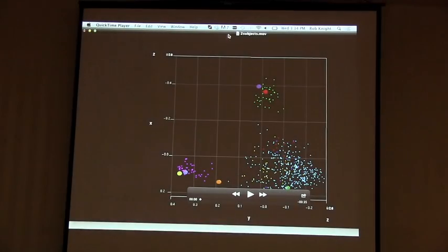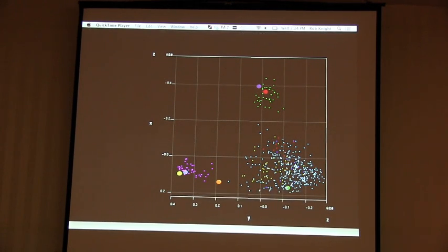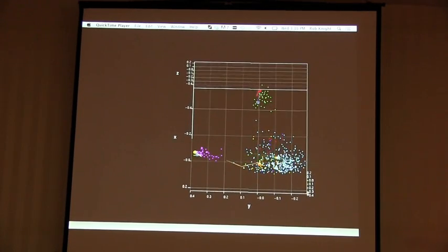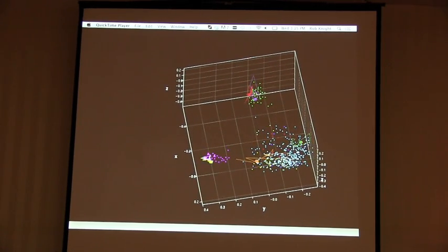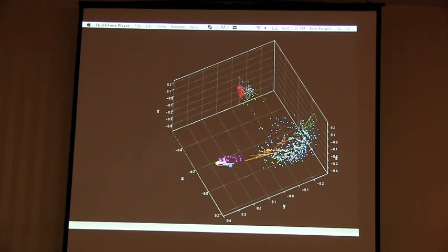And so Antonio, he's here at the meeting, put together this movie using as a framework all of the data from the Costello et al. study, and then animating the two individual people. Each step in this video is 1 day in the life of the microbiome. So the palm samples from 2 people, the mouth and the gut. And you can just immediately see the variability, like how variable the skin is compared to the mouth, for example.